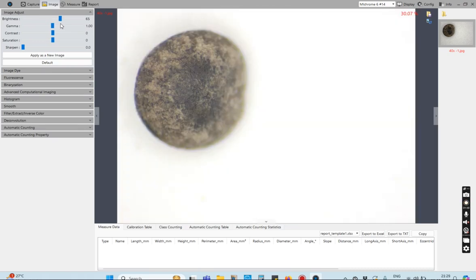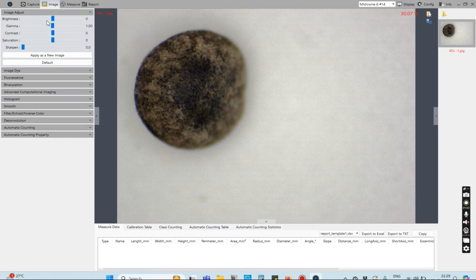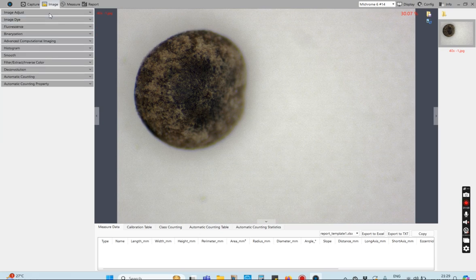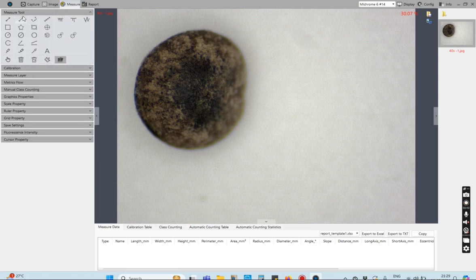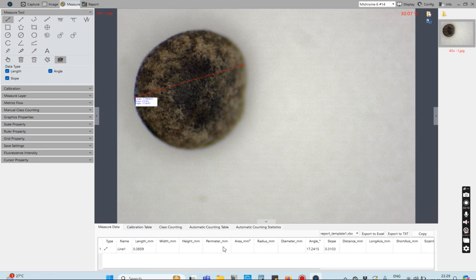I can do some operations here — I can adjust the image settings as needed, or click Default to reset them. Typically, we use these images to adjust color, contrast, or other parameters. This is one of the most used features in the software: Measure. In Measure, we have a number of measuring tools, which I'll demonstrate. Here is a line I have drawn, and you can see the corresponding parameters. You can also select shapes, write text, or delete items — these options are used to perform measurements.